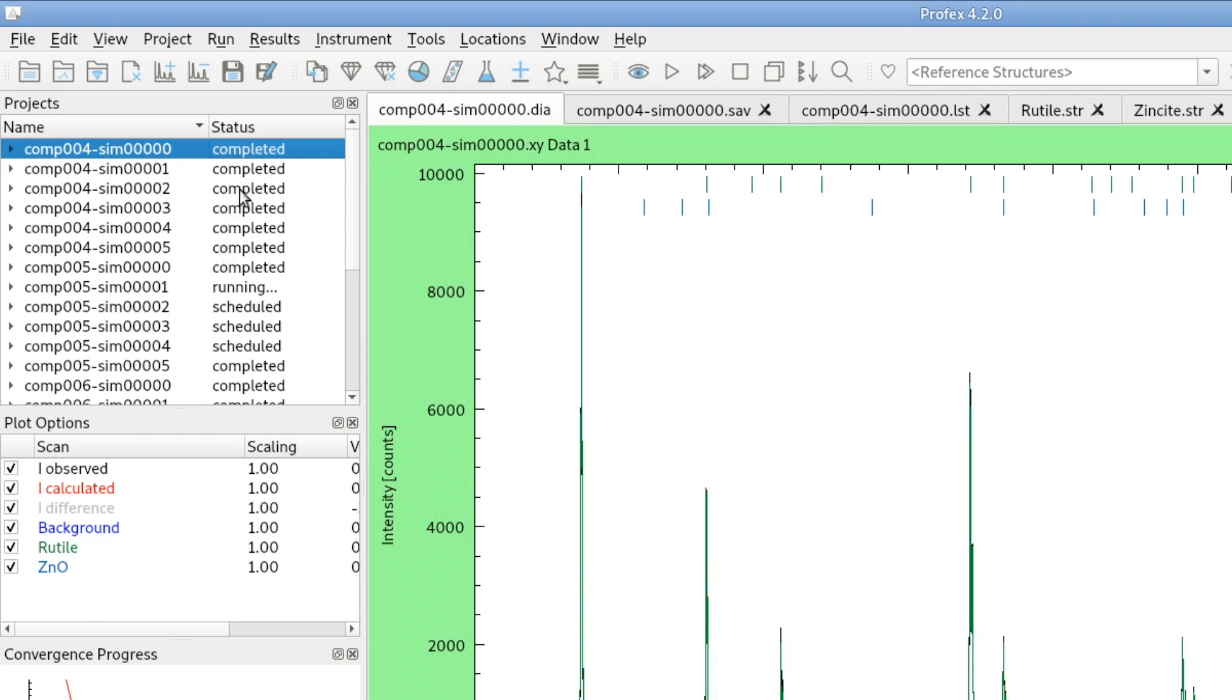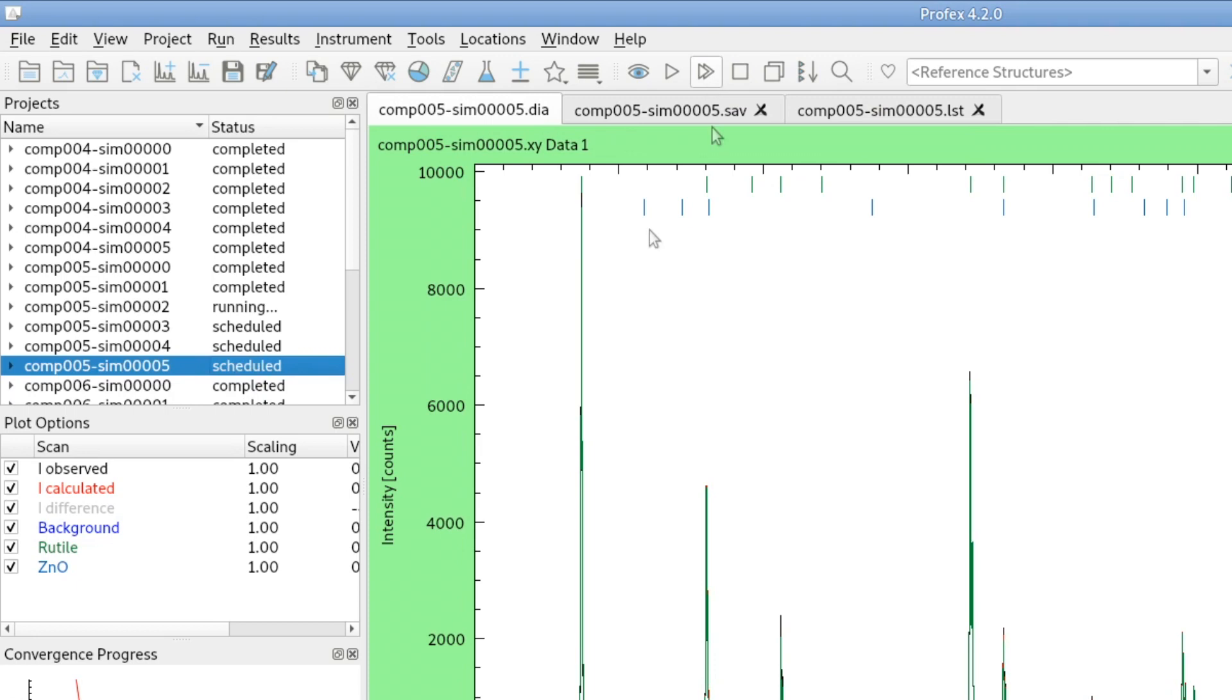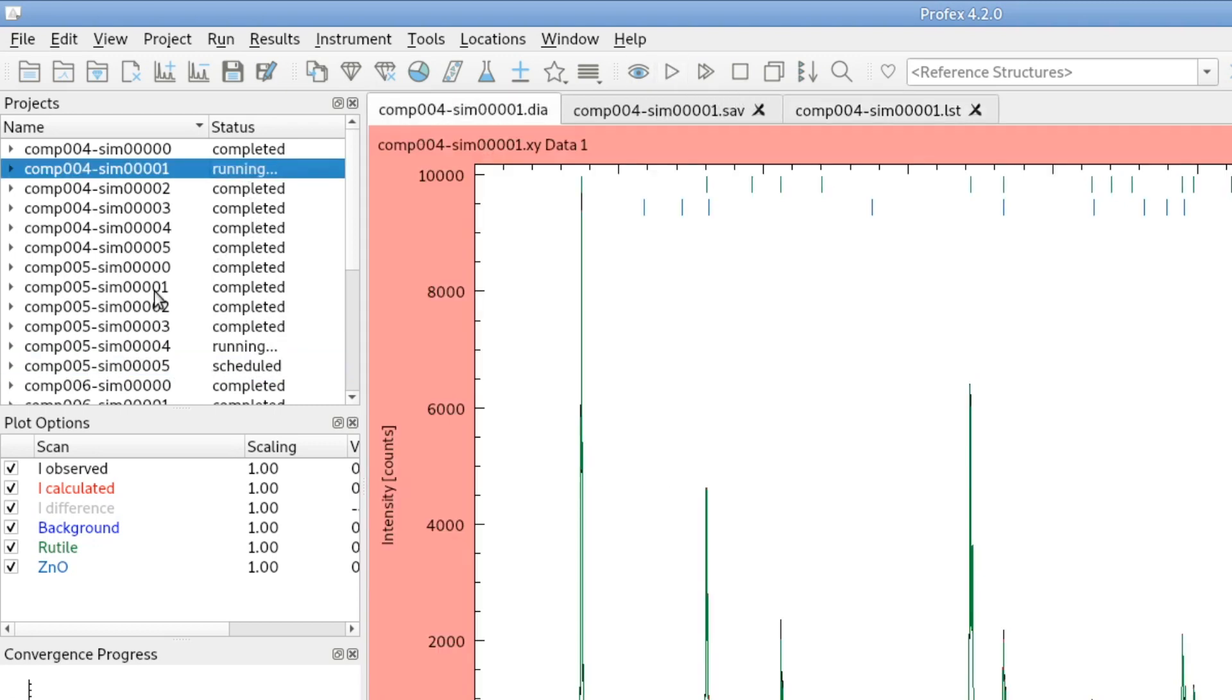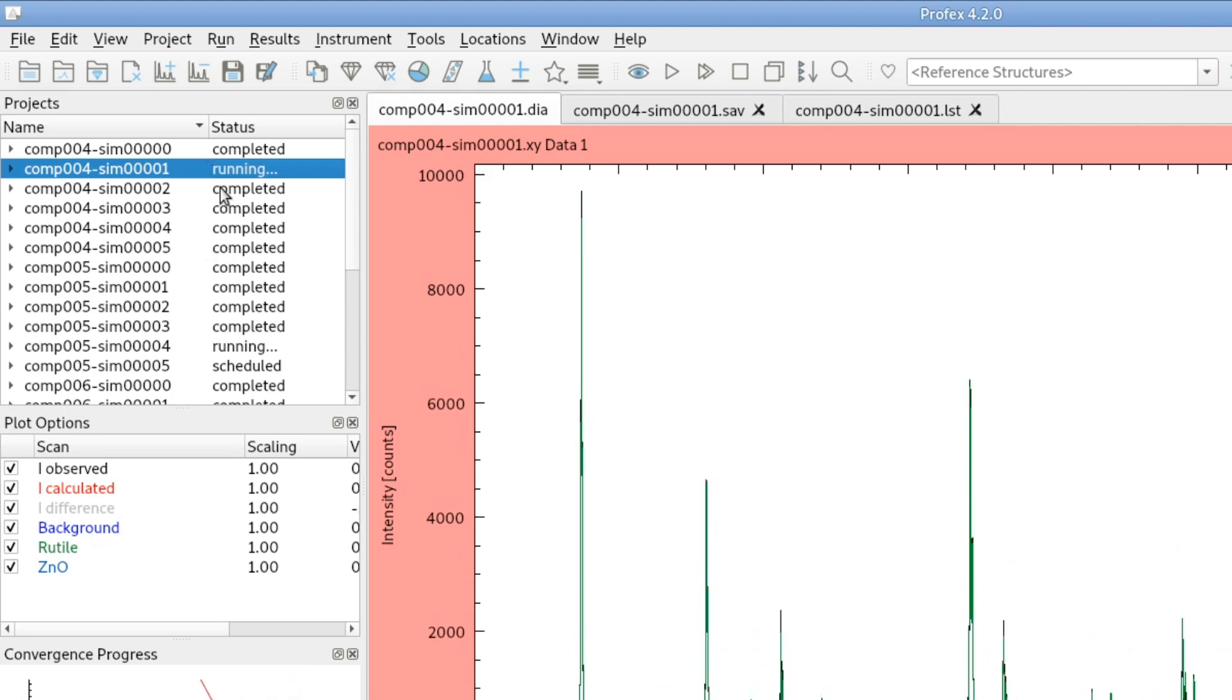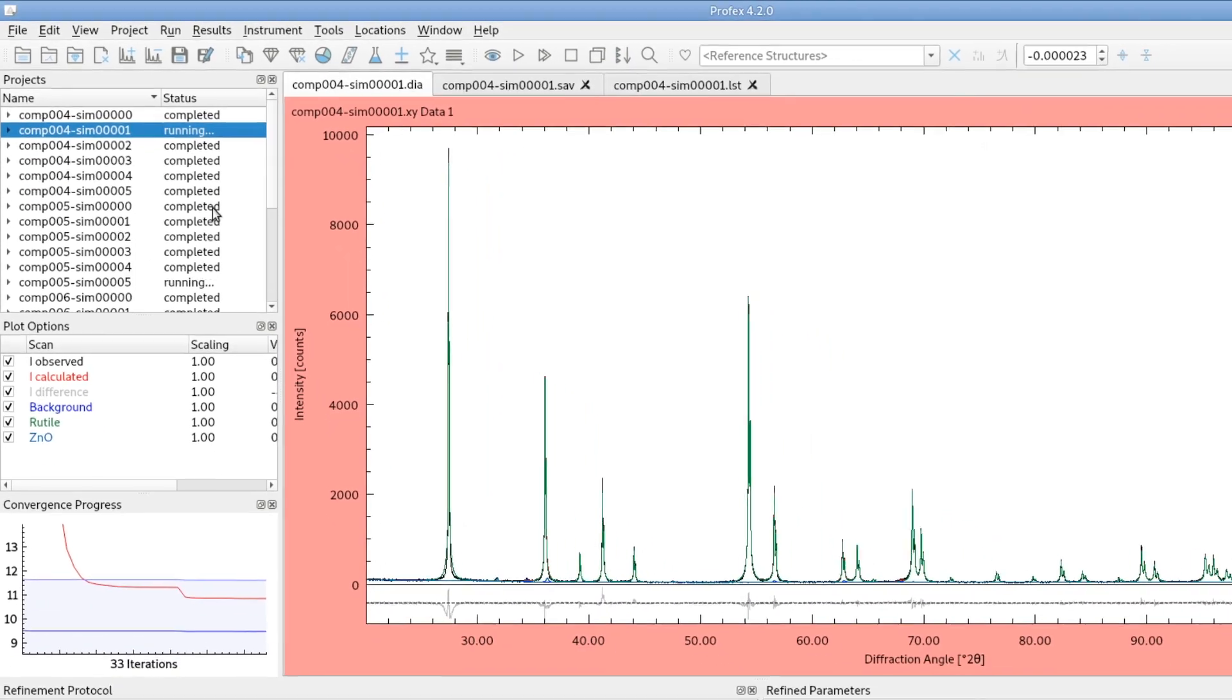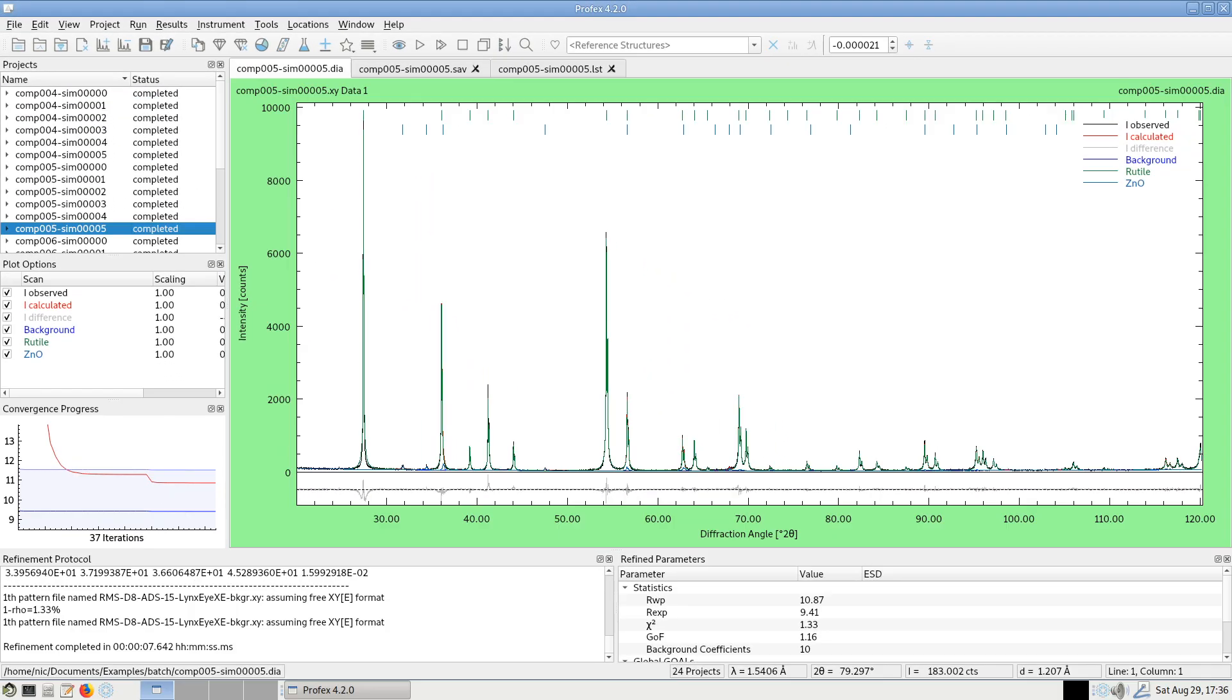If I select another project or multiple projects and click batch refinement again, it will not start a new refinement. It will just be appended to the running batch. So we can start an individual refinement like this one, but we cannot start a second batch. Instead, if we want to start another batch, it will just be scheduled for the running batch. This is how batch refinements work in Profex.